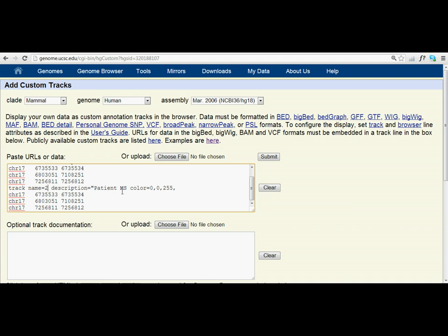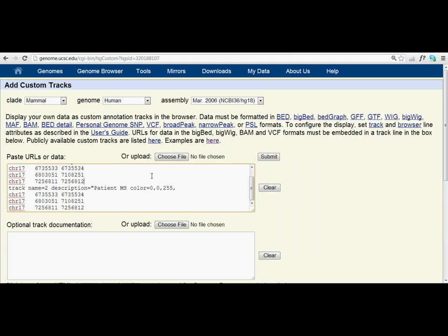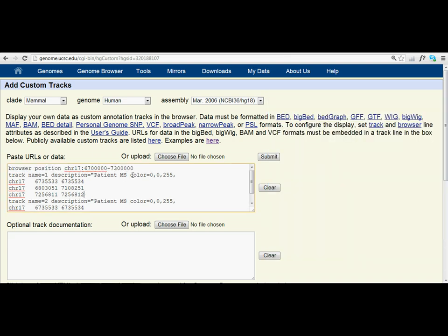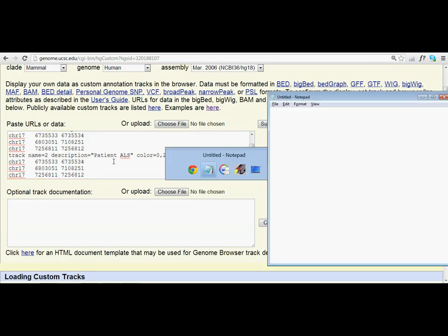Now we change the patient's description. So we change it to, in this case, it's not patient MS anymore. It's patient ALS. So we change it to patient ALS. And we can also change the color of it to make it something a bit different from the original one.